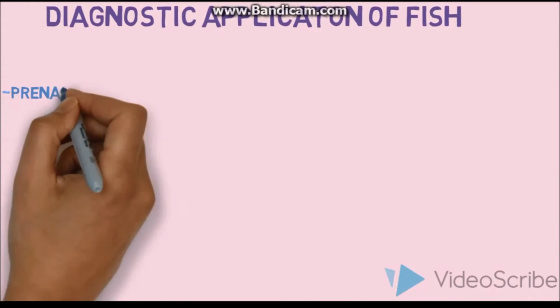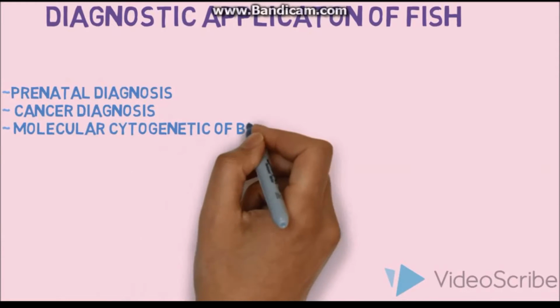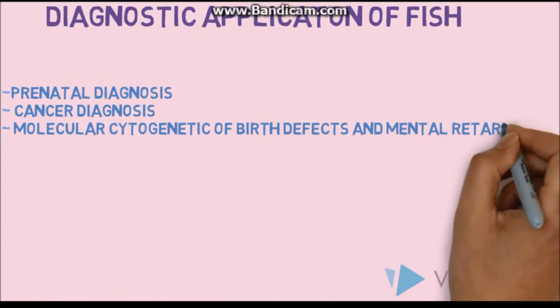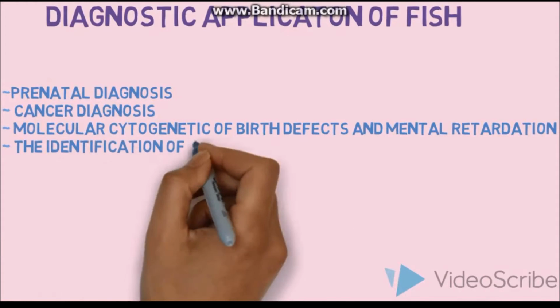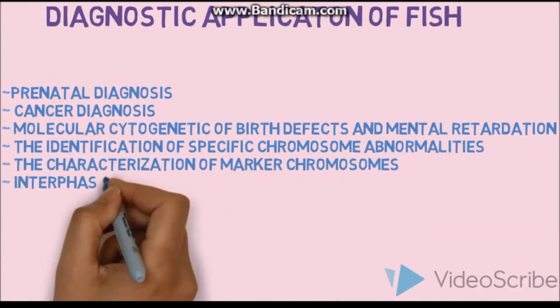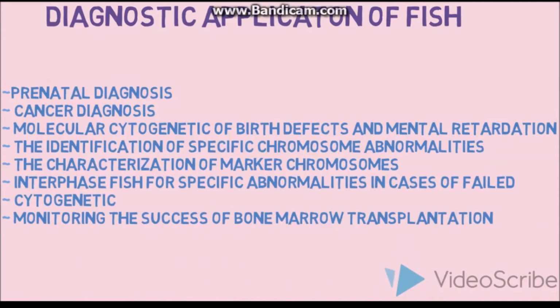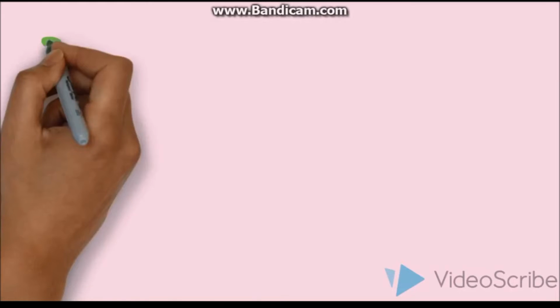Diagnostic applications of FISH: prenatal diagnosis, cancer diagnosis, molecular cytogenetics of birth defects and mental retardation, the identification of specific chromosome abnormalities, the characterization of marker chromosomes, interphase FISH for specific abnormalities in case of failed cytogenetics, and monitoring the success of bone marrow transplantation.